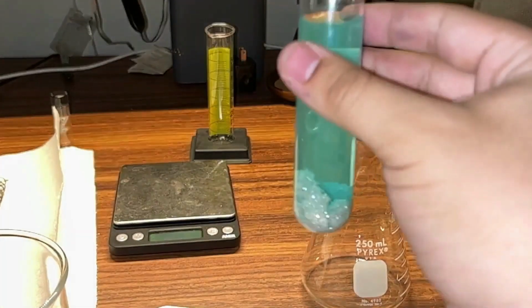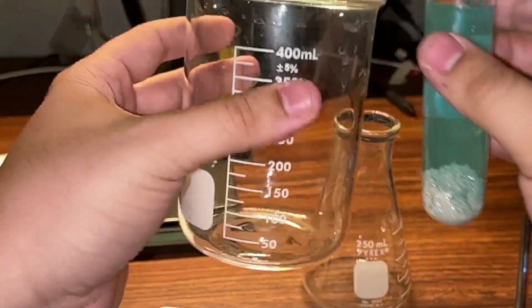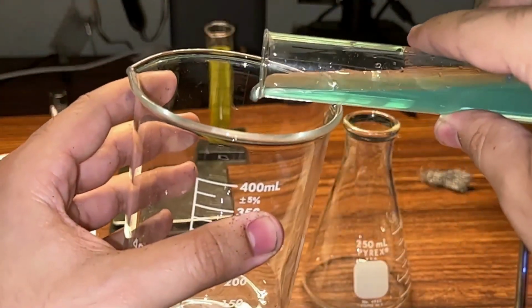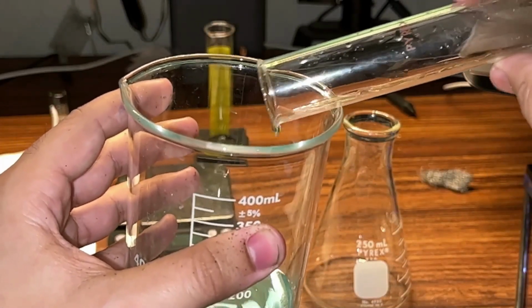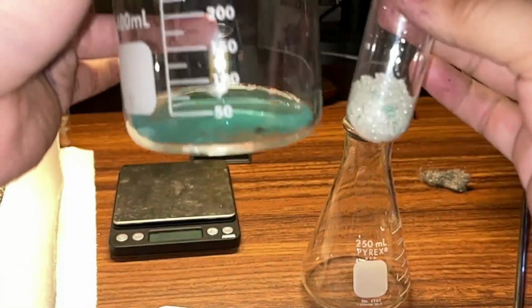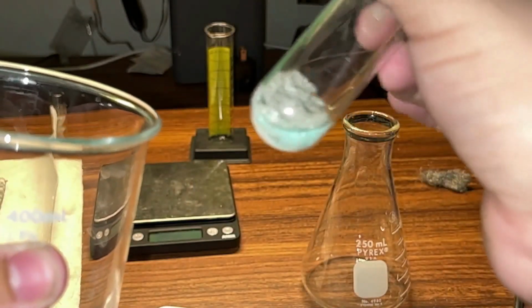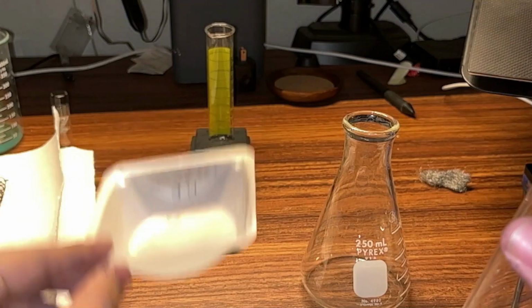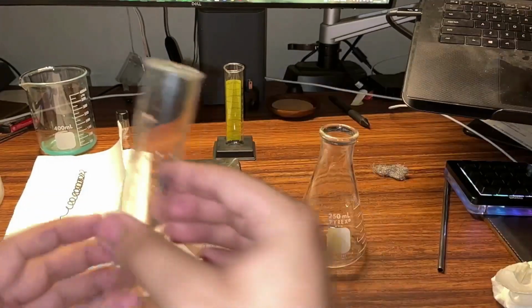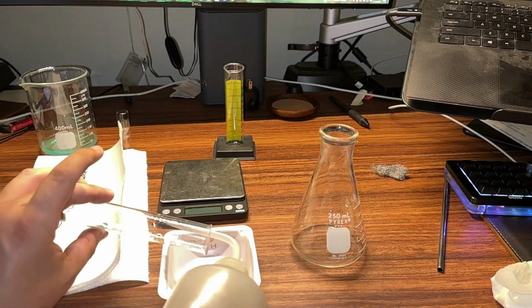Anyway, let's get going with this, because I want to decant my copper nitrate solution out of my test tube. This is just a waste beaker. You don't, because you're not doing the lab, but your classmates have a waste beaker at their station. And you can see I poured it so that the solution came out, but the silver is still in the test tube. You can see a little bit of blue solution still in there, but mostly silver, which is what I want. But of course, eventually I want the silver in my weigh boat, so I need to rinse it out into my weigh boat. So I'm gonna use my wash bottle, kind of tilt it like that.